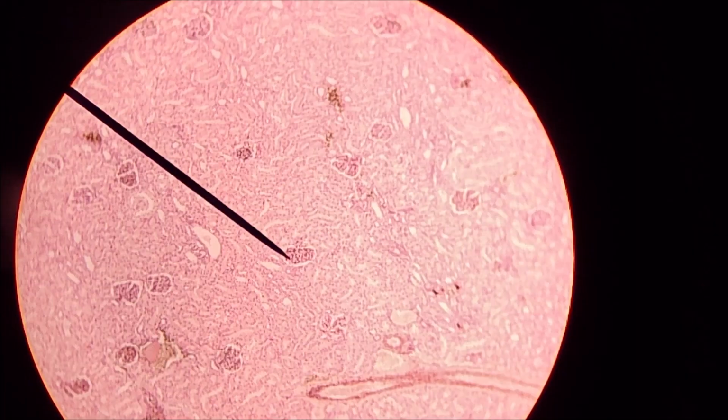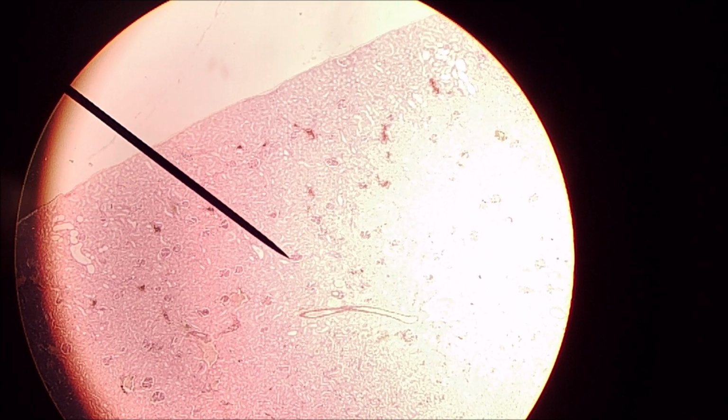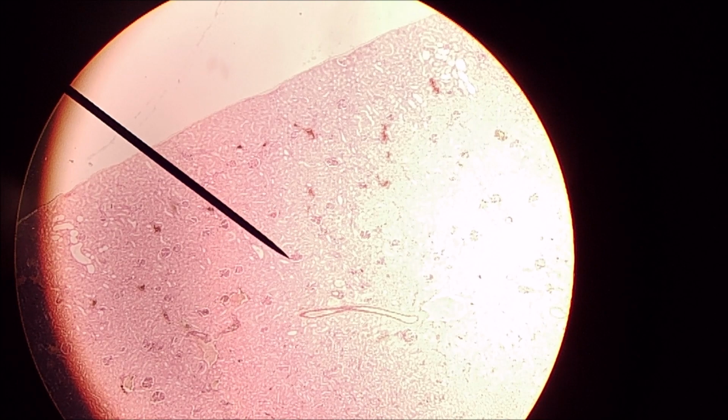What you see here is a kidney, and what you're looking at is a glomerulus. Now, I can actually go to a lower power here. This is on a four-power lens, and what you see, all these little dark spots found in here, dark spot, dark spot, dark spot, these are all the glomeruli of the kidney, which is where we're going to look at the Bowman's capsule, which is where we're going to find simple squamous epithelium.